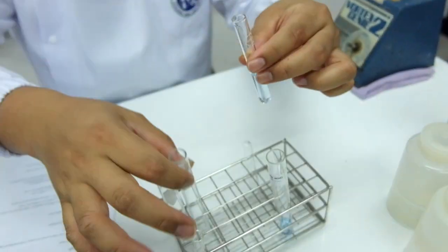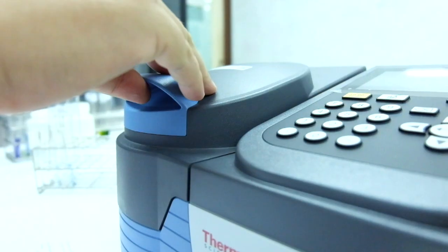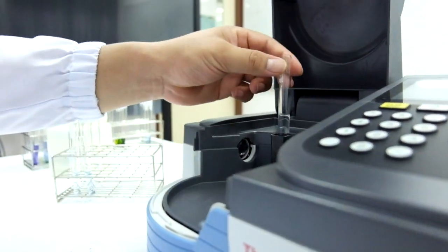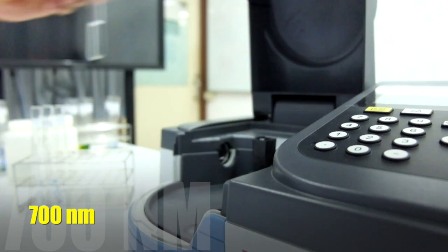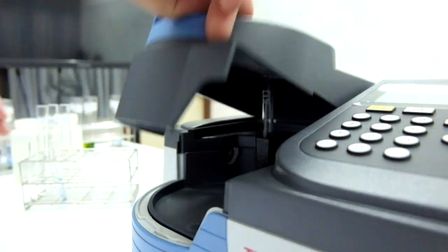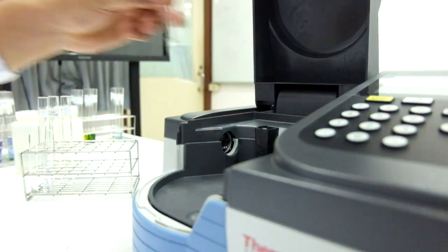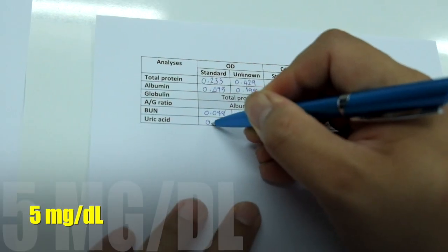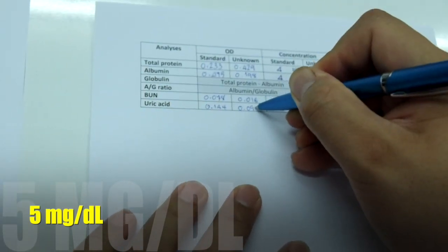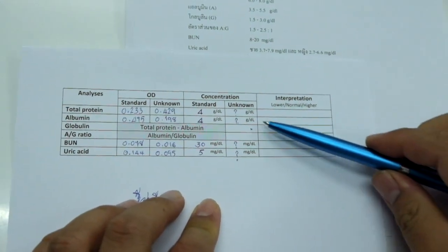Determine the absorbance in the protein-free plasma unknown and the standard uric acid at the wavelength of 700 nanometer and set zero with the water tube. Record the absorbance and calculate for the uric acid concentration from the standard absorbance value with 5 mg per deciliter in the concentration, and take a note of the results.